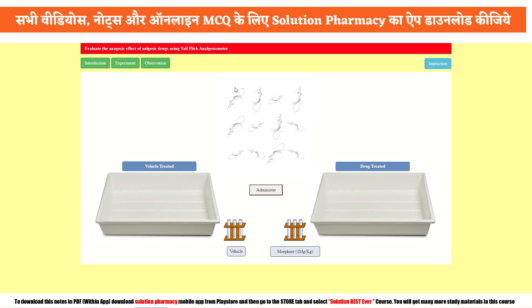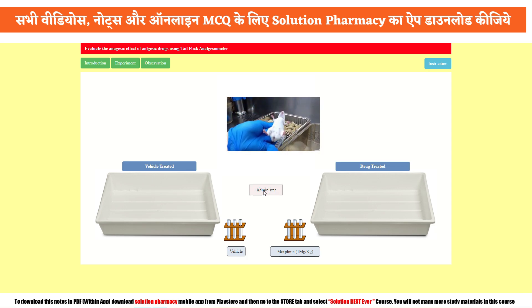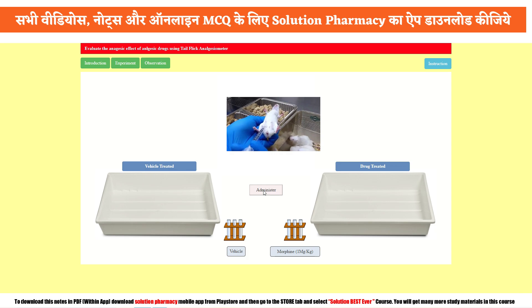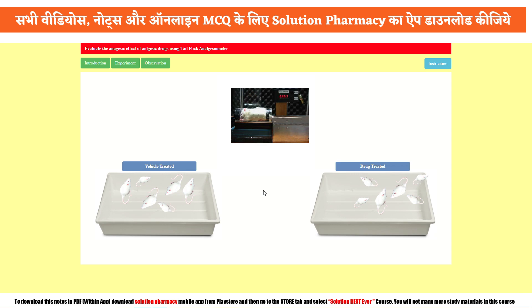As you can see on your screen, there are 12 rats and we have to perform this experiment with all of them. First, we need to separate them into two groups: vehicle treated and drug treated. Vehicle treated groups receive no medicine — only the vehicle, meaning the solvent. Drug treated groups receive the drug to be tested, such as a plant extract. If water is used to dissolve the plant extract, that water is the vehicle. Click the administer button to begin.